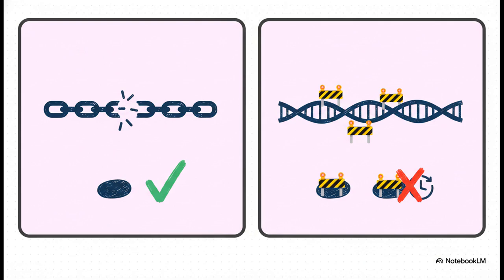So how do you tell them apart? The IPC is the key. The IPC is a small synthetic piece of DNA, so it can't be degraded. If the IPC looks normal, your diagnosis is degradation. But if the IPC is delayed or failed, the diagnosis is inhibition.